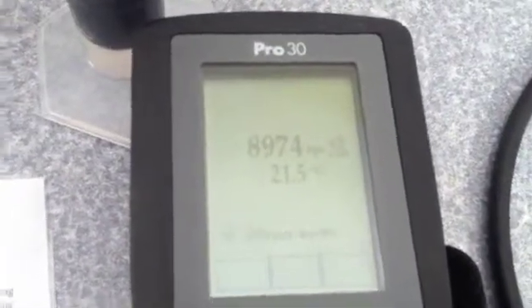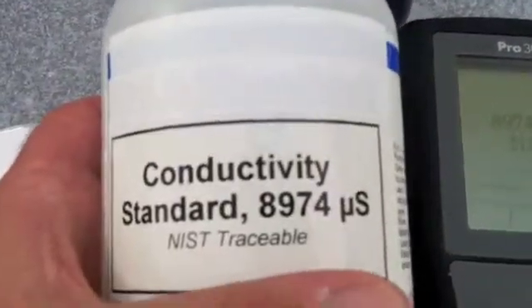At this screen, you use the up and down arrows to adjust. Just make sure you go up or down to match the standard that is on your bottle, and we are there right now.